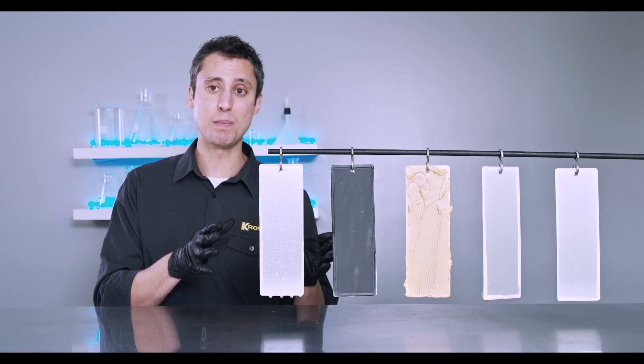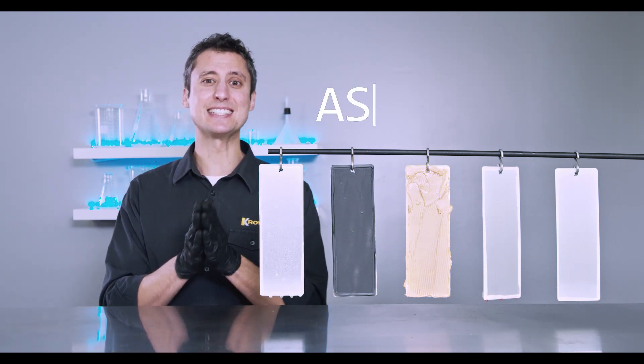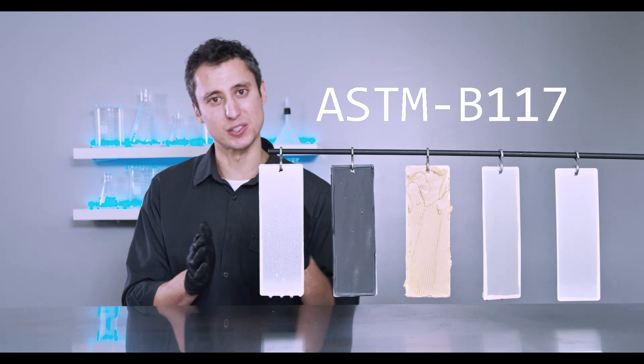Now we're going to take these samples, we're going to put them in the salt spray cabinet chamber, and we're going to perform that test, the ASTM B117. So come with me.